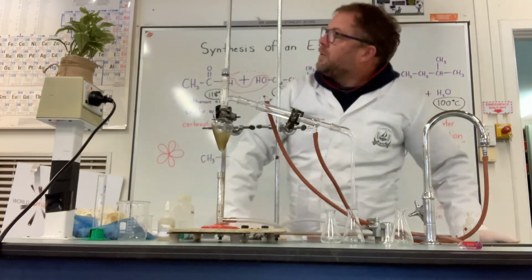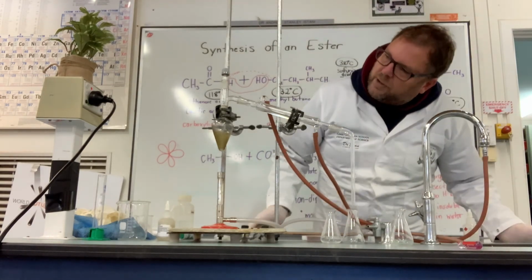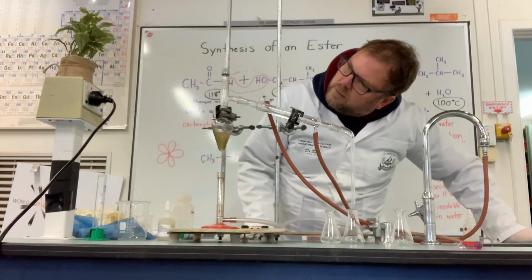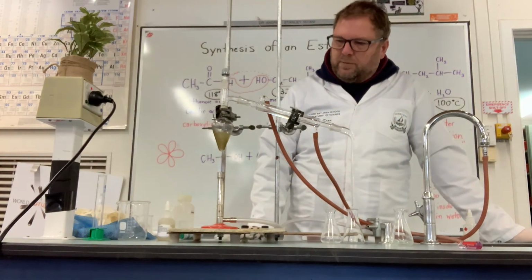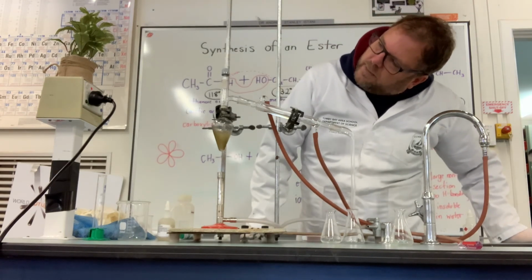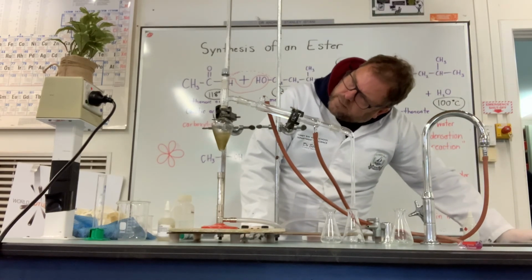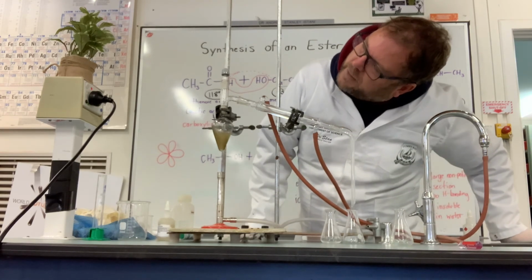Now we're up into 130 degrees. Sorry, that probably changed that a bit early. Let's look. Yeah, so that's sitting steady at the moment at about 130, so that's probably still the alcohol coming across, the unreacted alcohol that we started with. The thermometer is really hard to read.